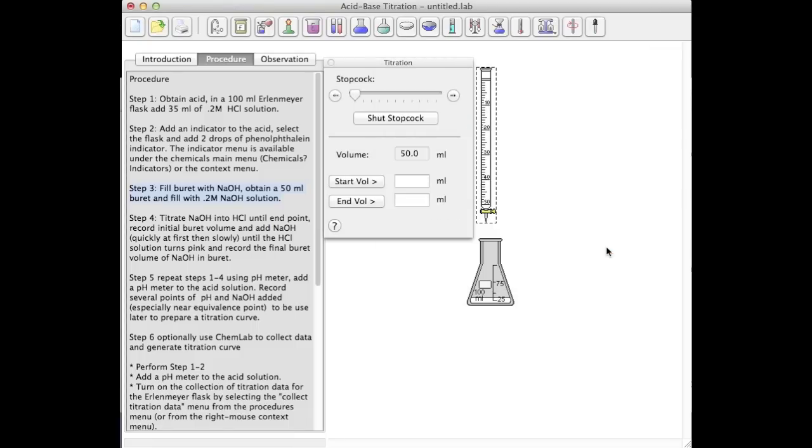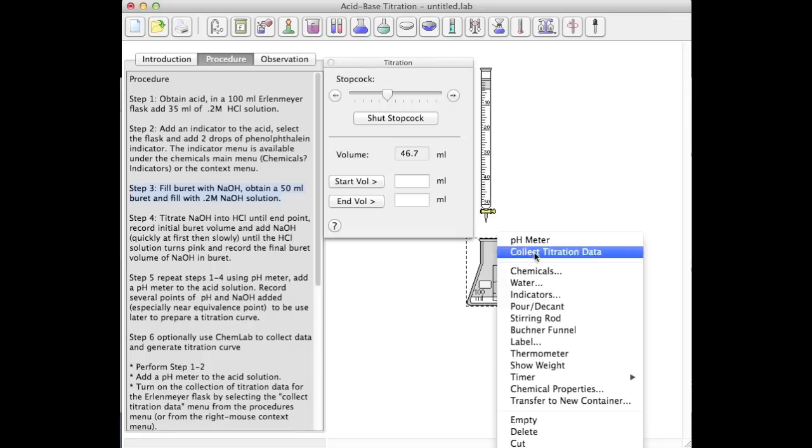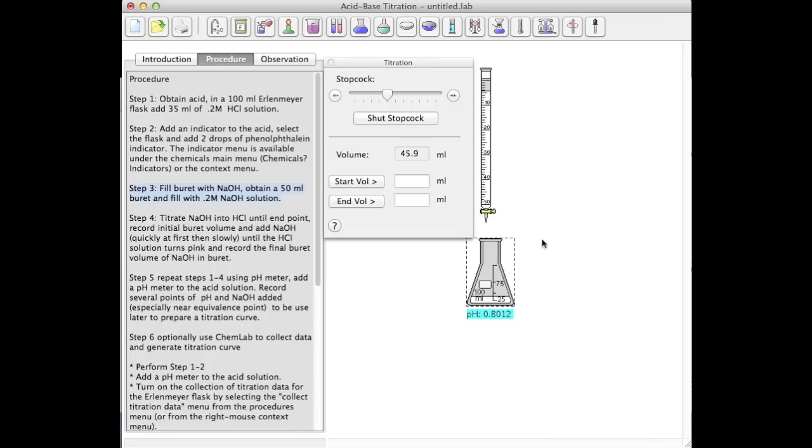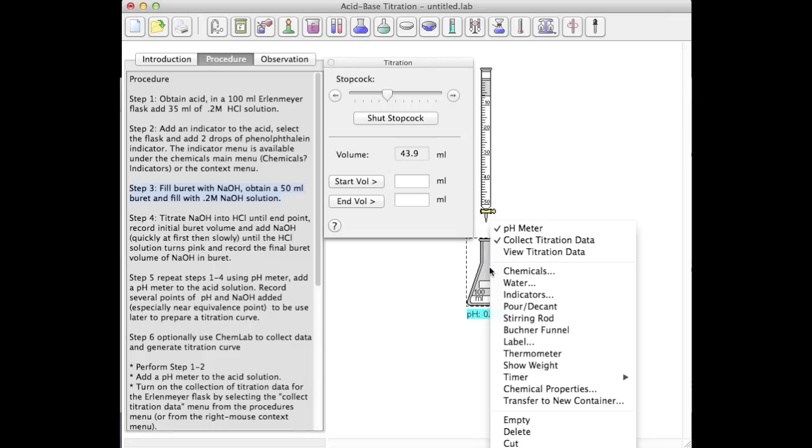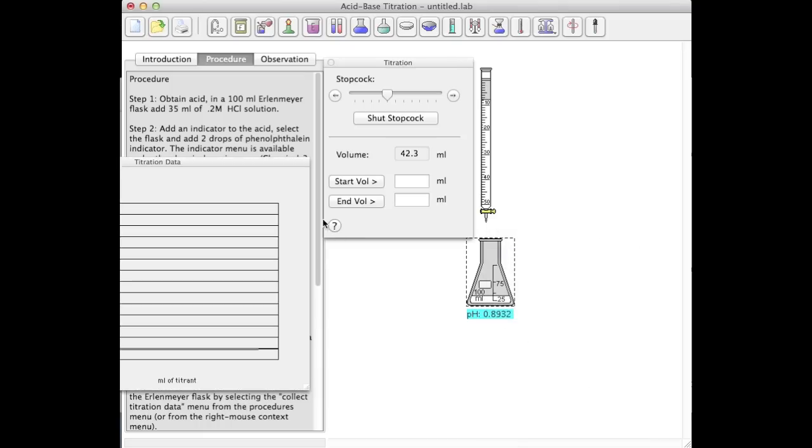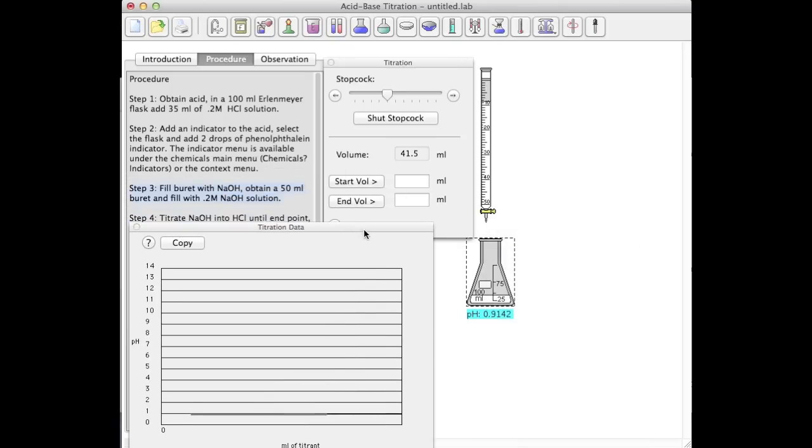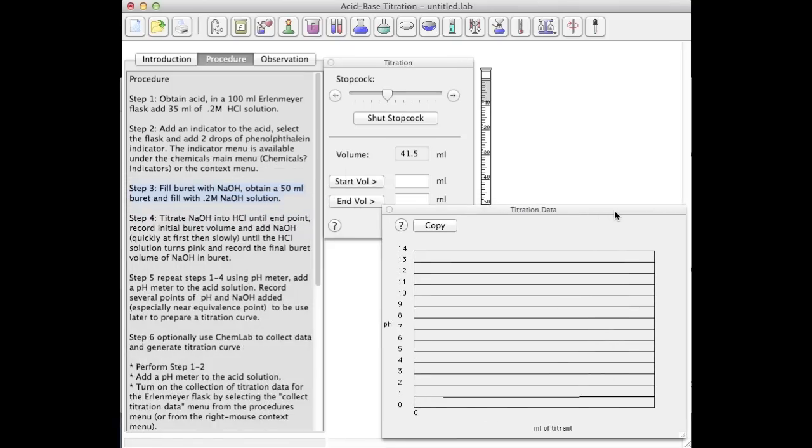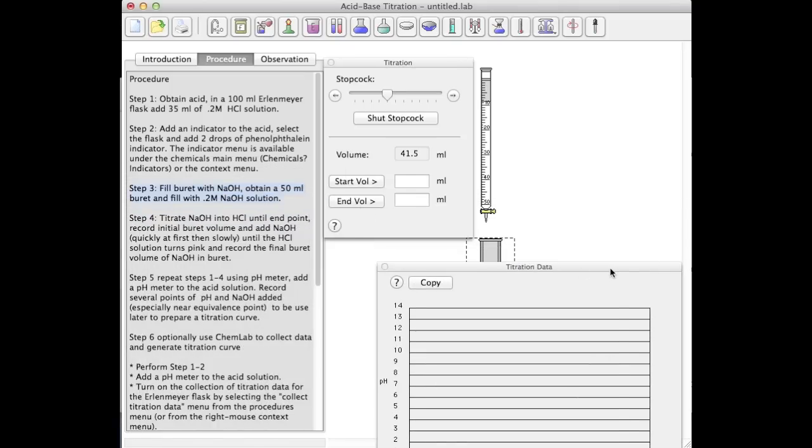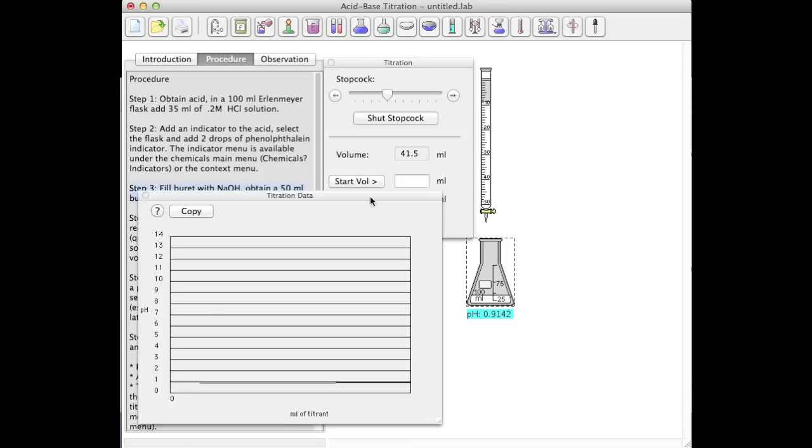Now, I'm ready to start titrating. I'll do so by using the titration dialog box. It allows me to control the flow rate. I'm also going to turn on some data collection and generate a nice titration data curve.